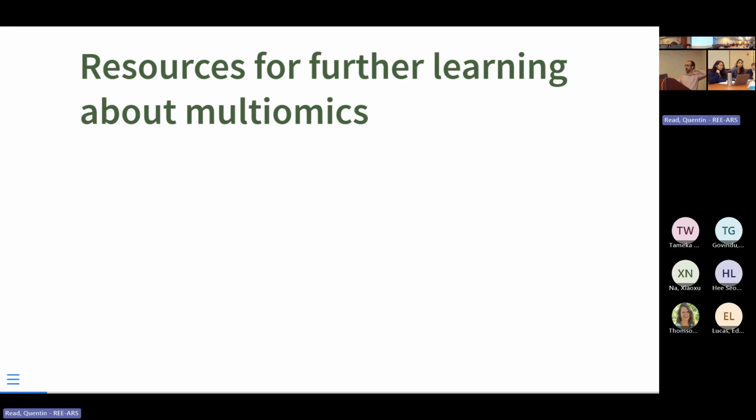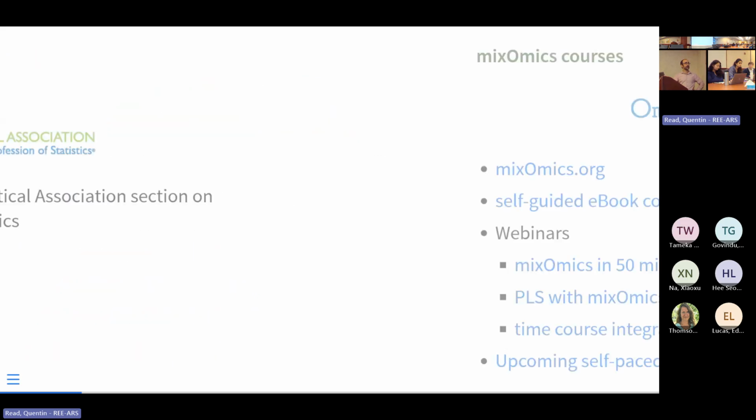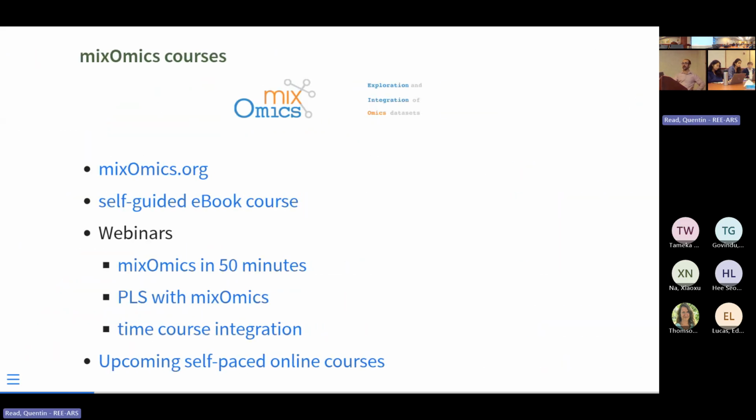Sorry about that. Before we actually start, these links will be in the slides that you can look at later. There are some great resources out there for learning about multiomics, so I'll just go over them. The American Statistical Association has a short course on statistics and genomics and genetics, which includes some of the multiomics stuff and a series of lectures. They have it in text form and video form, so that's a good one. mixOmics is one of the main packages in R that we are going to be using over the next couple of days to analyze our omics data.